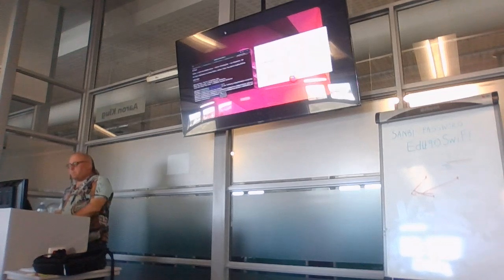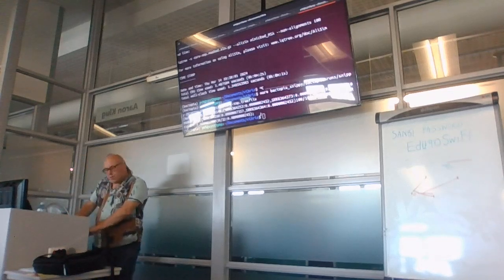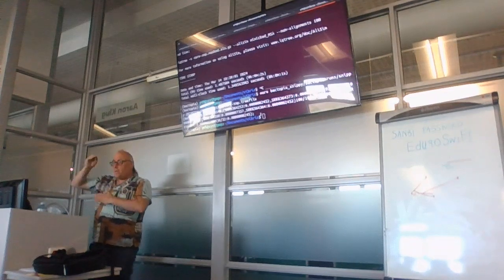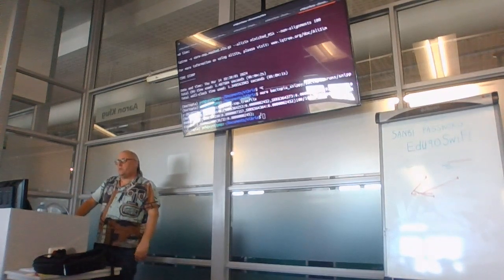So can I say the one with the lesser number might have more mutations? No, you can't say anything from bootstrap. You can just say it for the branch length. Branch length equals mutations, not bootstrap. Bootstrap is how certain, given the data, that the shape is right. Length is how many mutations we're dealing with. Okay.